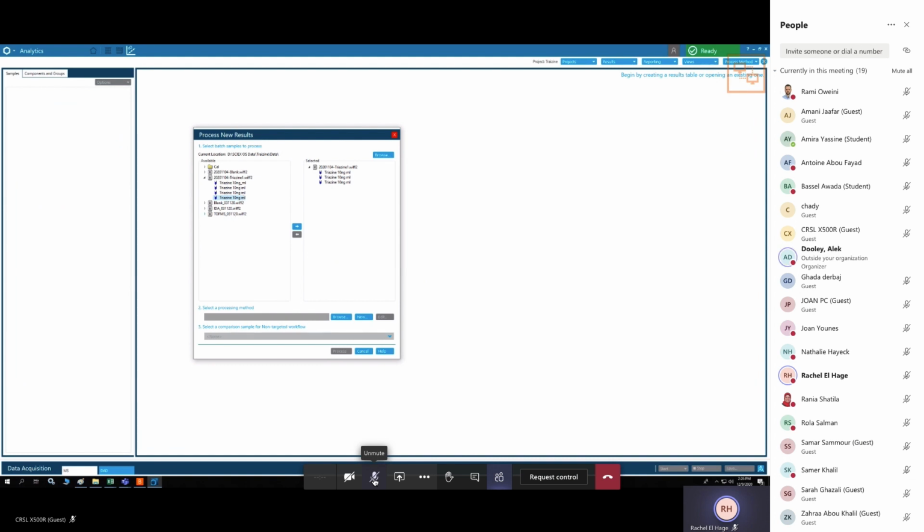There is. So what is TOF MS? So they did TOF, TOF MS/MS, and alone, IDA, it looks like. They did IDA. I don't know what this actually is. So actually, that's a good point. I didn't catch that. Let's look at the IDA because it's a little bit more interesting. Okay, we'll do the IDA.